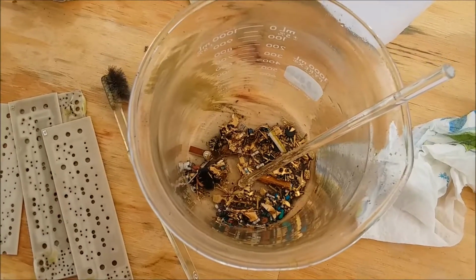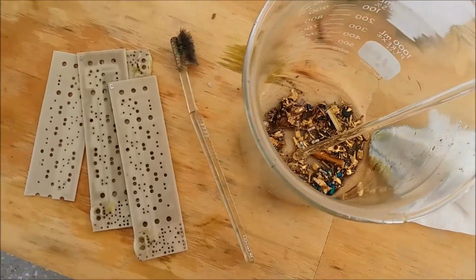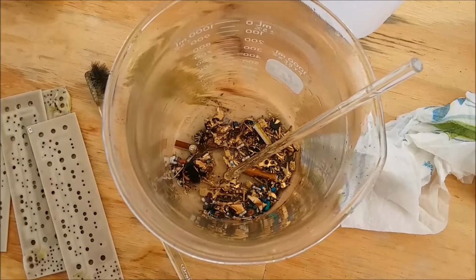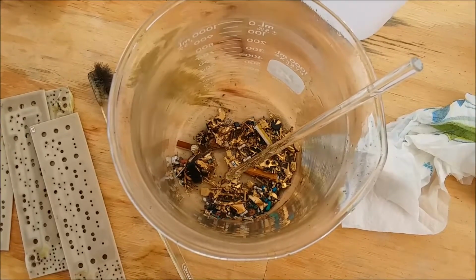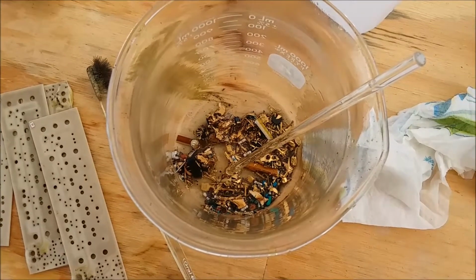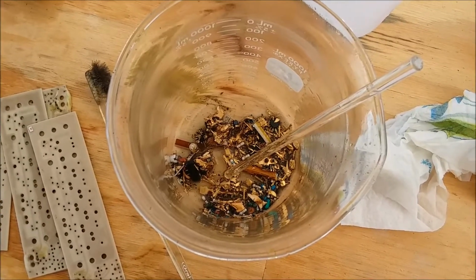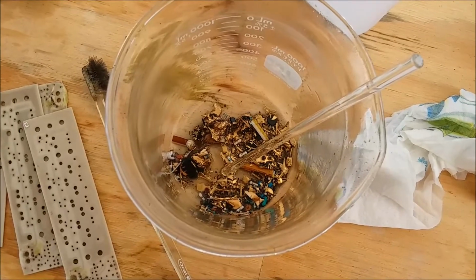What I will probably do, and I don't know if I have the time for it today, is get all the gold back in one beaker, and then probably use muriatic acid and bleach to dissolve it, since it's all foils. That method doesn't seem to work very well with chunky gold, but it does a number on foils really quickly. So muriatic acid and bleach will dissolve gold.